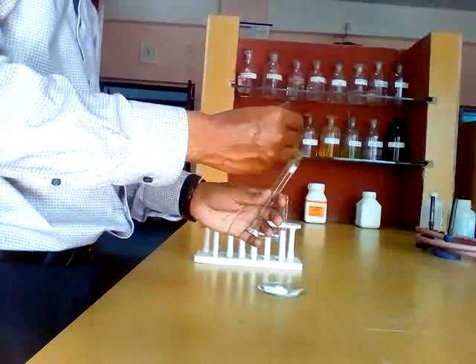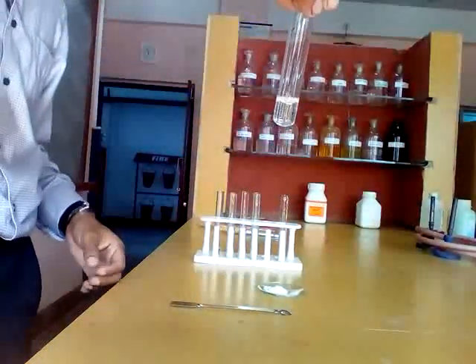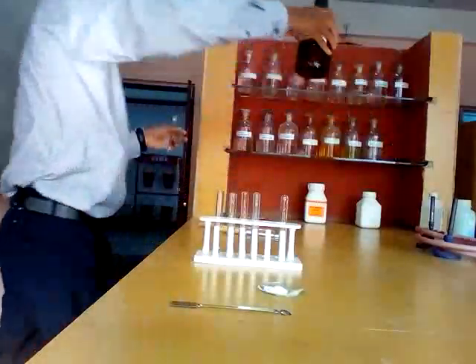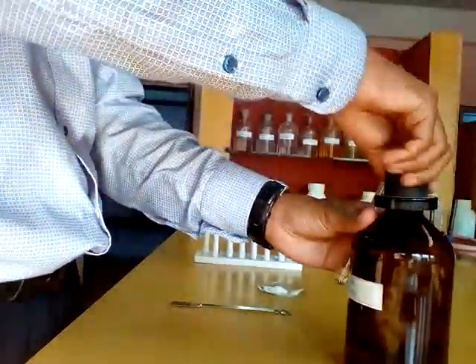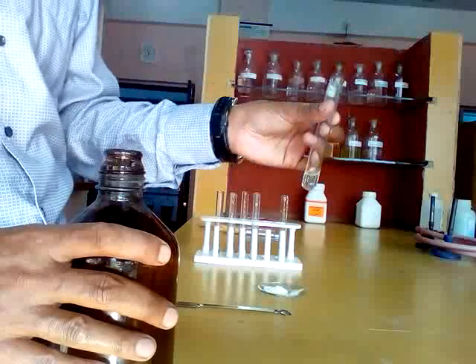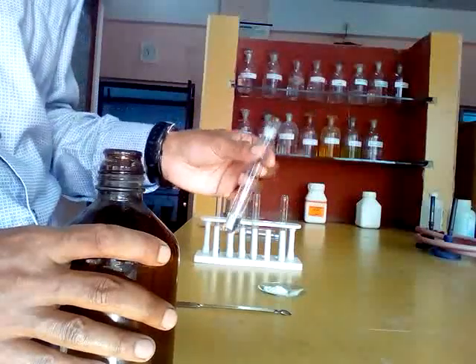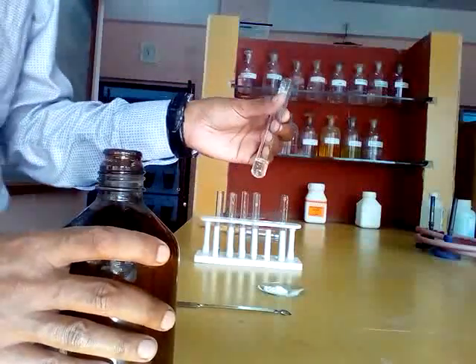Take some salt in a test tube, then put water and dissolve it. So this is called salt solution. Then we have to add silver nitrate solution here. This is silver nitrate. After adding silver nitrate solution, if you get white precipitate, then it is chloride. If you get pale yellow precipitate, then it is bromide. If you get fully yellow precipitate, then it is iodide.